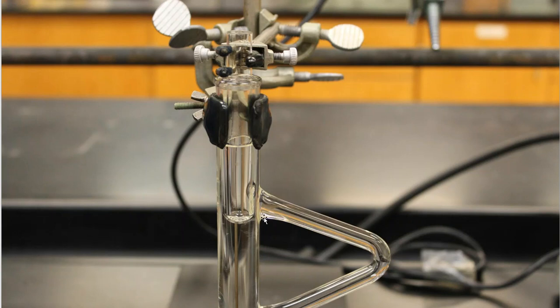All right, so here's a Thiele tube. And the Thiele tube is just basically a piece of glassware that has this elbow on it. And this Thiele tube is filled with mineral oil. And what you see here is a smaller test tube that I have submerged down into the Thiele tube with that mineral oil. Now at this point, that test tube is empty. I need to put my solution that I want to measure, boiling point wise, into that test tube. I do not put anything in the Thiele tube except for the test tube. So this Thiele tube should stay nothing but mineral oil.